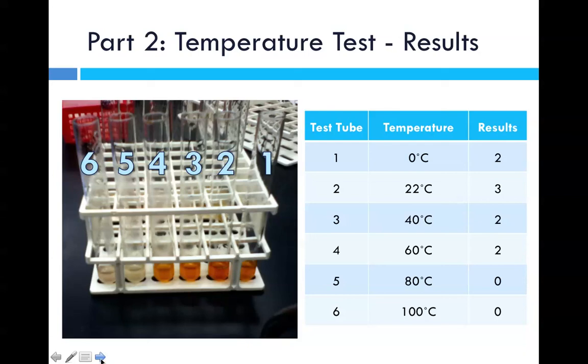So that we labeled as our number 3, which means the most change or most reactive. And then 1, 3, and 4 were second most reactive because they had a definitely distinct coloration of brown. Yet 5 and 6 had very little or no coloration, so that's why they were 0.